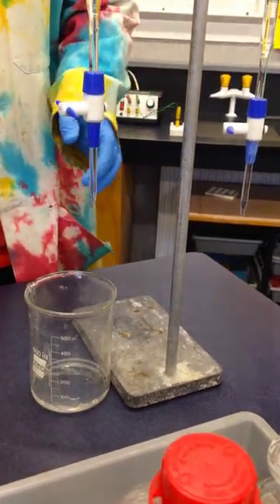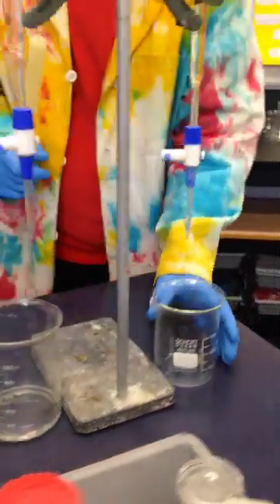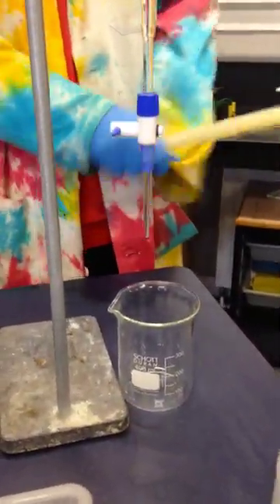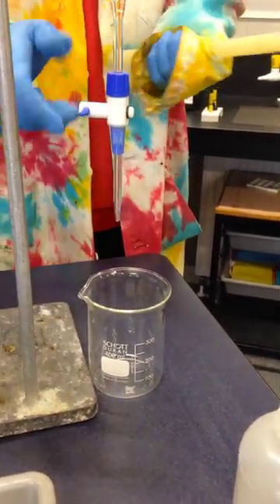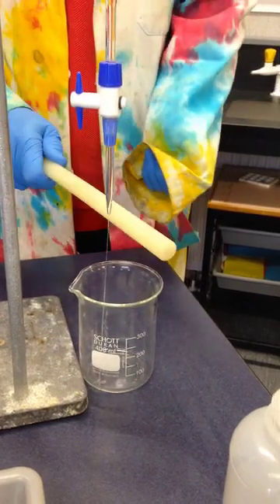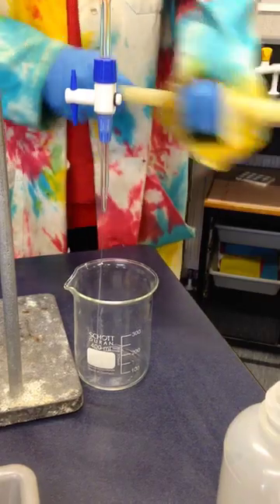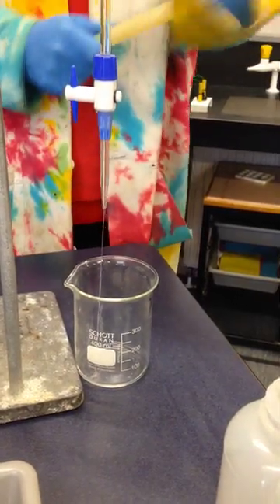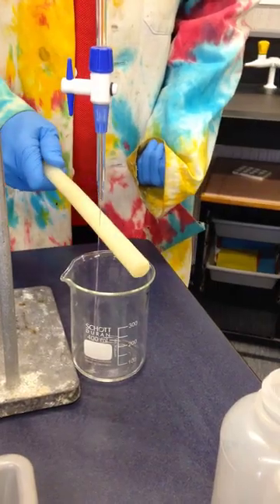As opposed to the hexane. So if I do the same with hexane, we'll get something different here. And if I bring the charged rod up close to that, even if I rub it harder, it doesn't bend towards the rod at all.